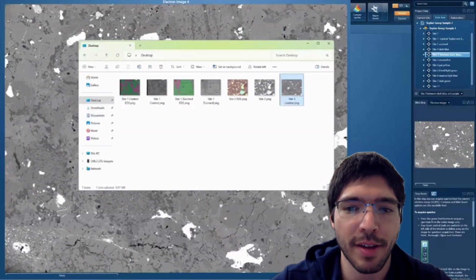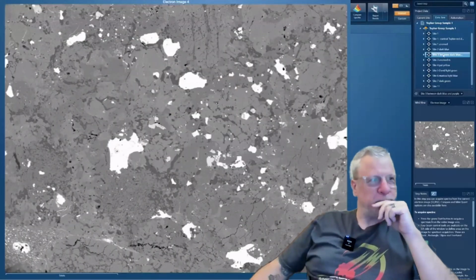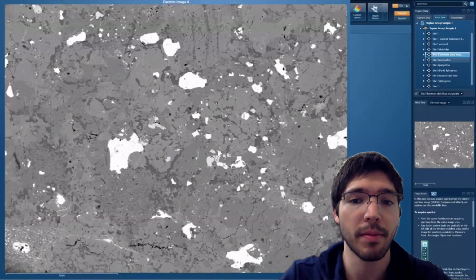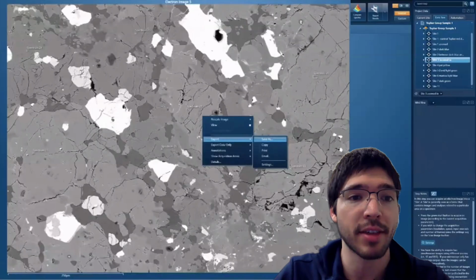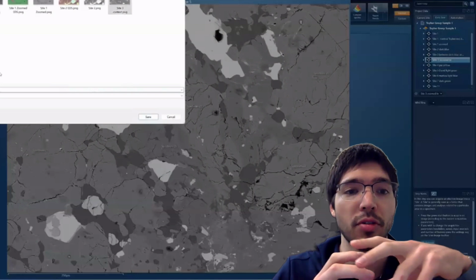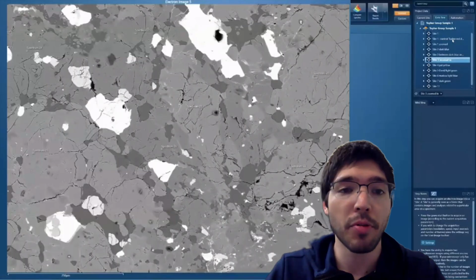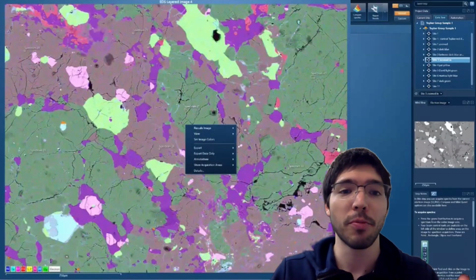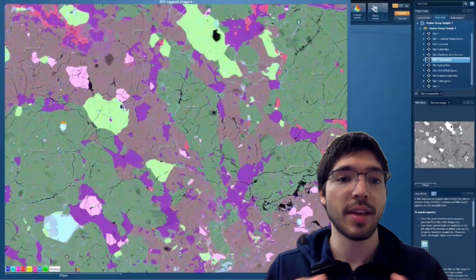Essentially, I'll go into a little more detail on that process since we have a little bit of time. When electrons from the beam interact with atoms in your sample, you can get two primary interactions that I'm documenting when I do the classification process. The first is those grayscale backscatter electron images. That happens because the electrons, depending on interactions with the nuclei of different atoms in your sample, depending on how many protons you have in that nucleus, which if you have materials that are rich in metals that have a lot of iron, a lot of nickel, you're going to have some big nucleus because they have high Z values.